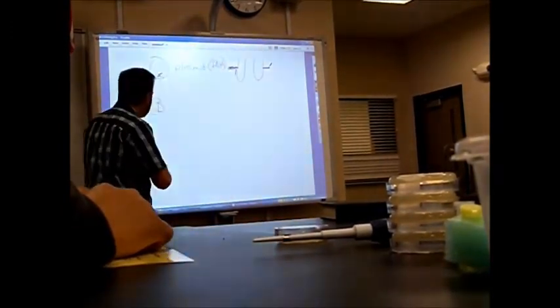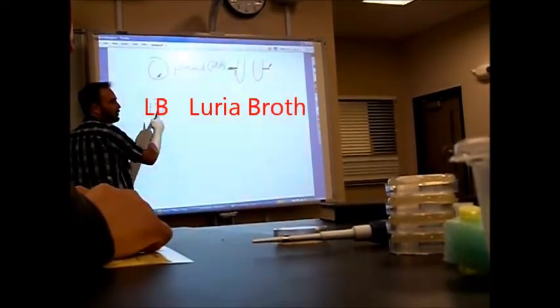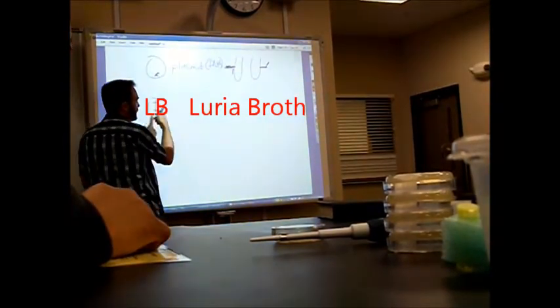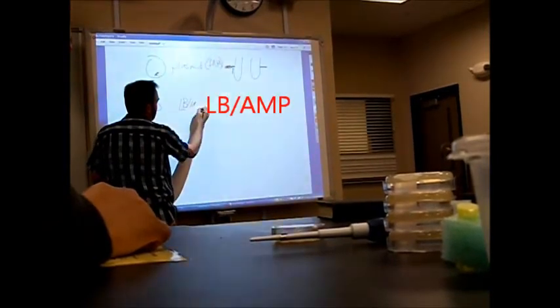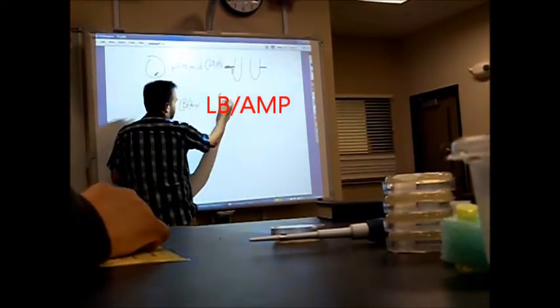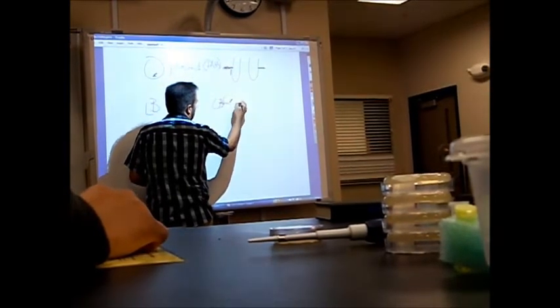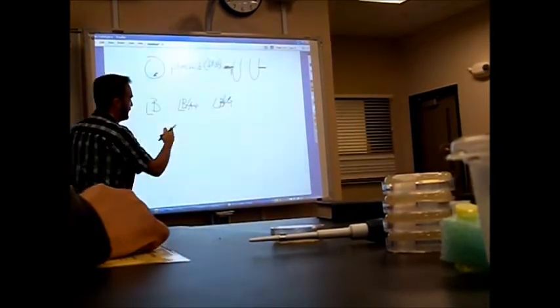Then you've got four little plates where you're going to plate them out. You've got one that's labeled LB. LB is Luria broth. That's the food. Obviously, without the food, nothing's going to grow, right? They need to be able to eat. Then you've got two plates that are labeled LB amp. What do you think the amp stands for? Ampicillin, right? So what's ampicillin again? It's the antibiotic that's going to potentially kill them.